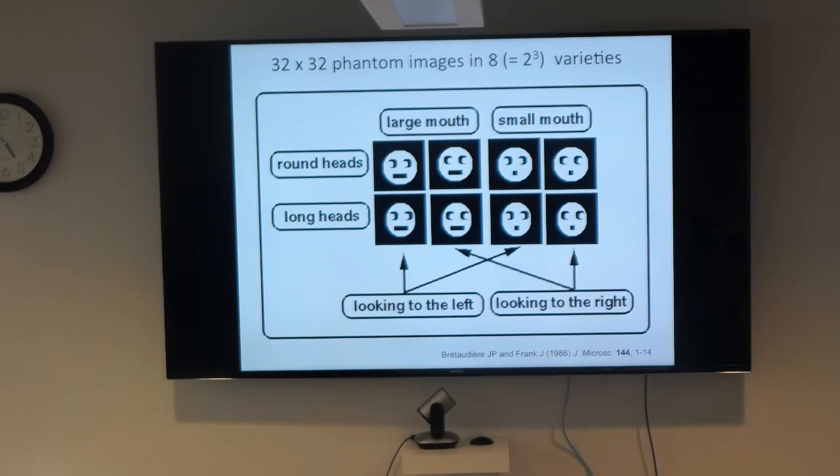And then I think he's also been on record saying what is needed in the future right now would be maybe a 100 kV FEG microscope with a direct detector. So we have some idea about samples, freezing methods, some idea of what an ideal microscope might be. But what's missing is software and algorithms. What developments do you think will be on the horizon that we really need to work on in that space?